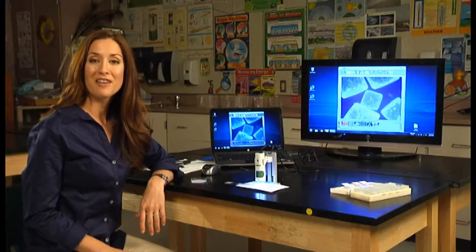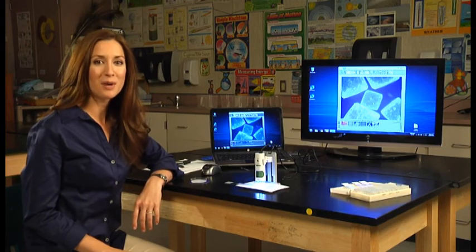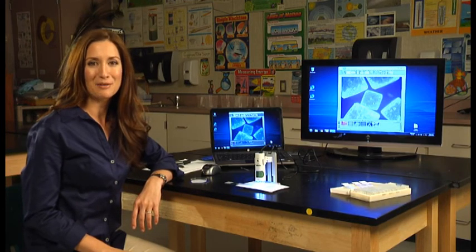The SmartScope 500 is fun, it's easy to use, and it's a great way to get your students excited about learning.